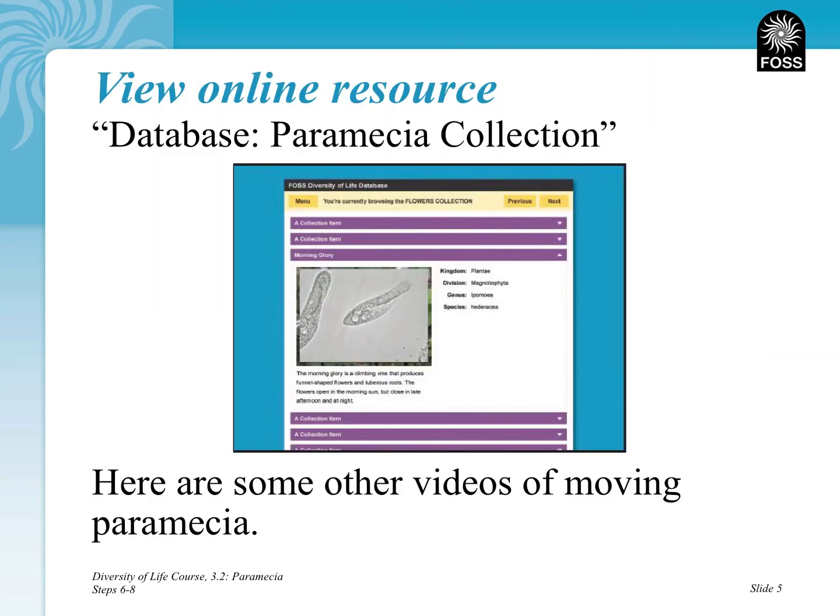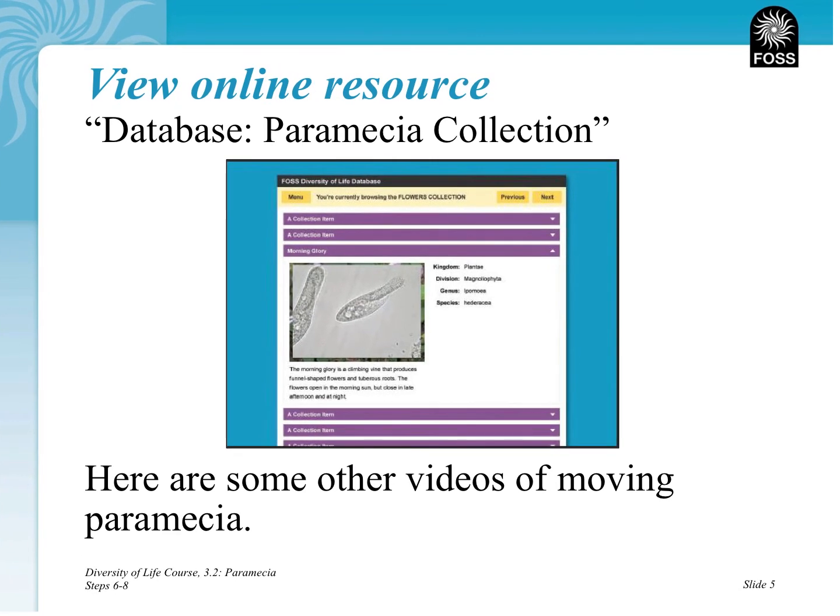For those of you in class, you were hopefully able to find a paramecium and to draw and describe its movement, even as it slowed down. For those of you that are virtual or missed it for whatever reason, or if you weren't able to find one, what I need you to do is to go to the online resource again, the fossweb.com. Let me move that back up here, hang on.